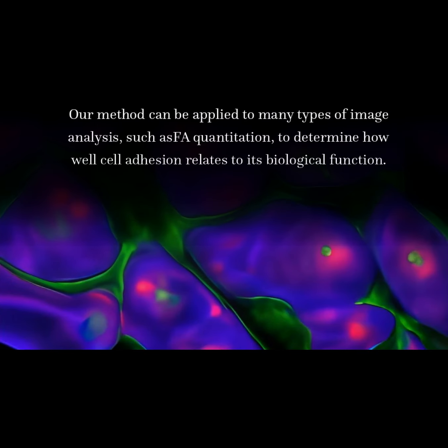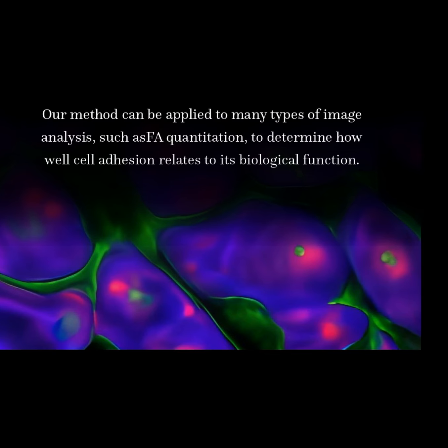Our method can be applied to many types of image analysis, such as FA quantitation, to determine how well cell adhesion relates to its biological function.